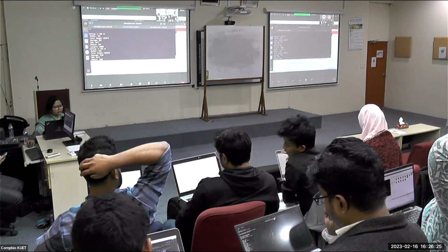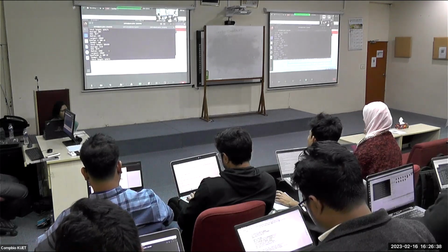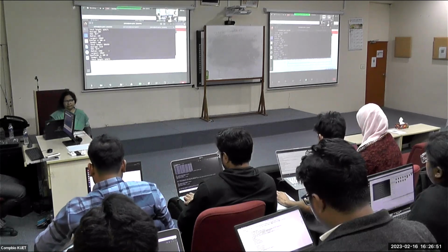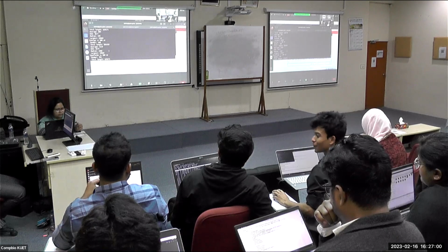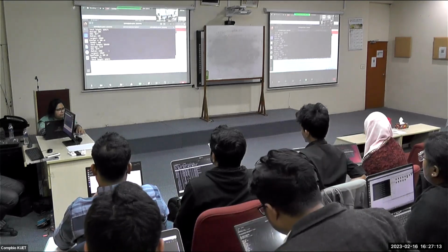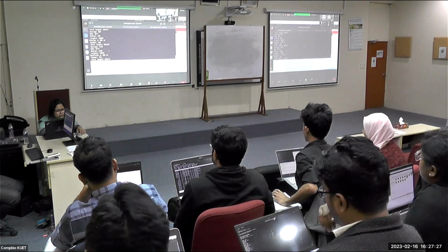the N50. Who can tell me what the N50 is? You remember? At least half of the sequences are greater than 4,877 base pairs. So in the file, we have at least half of the sequence length at 4,877.